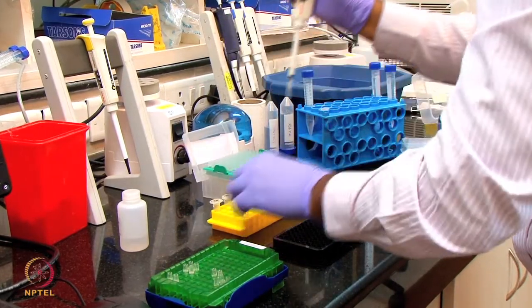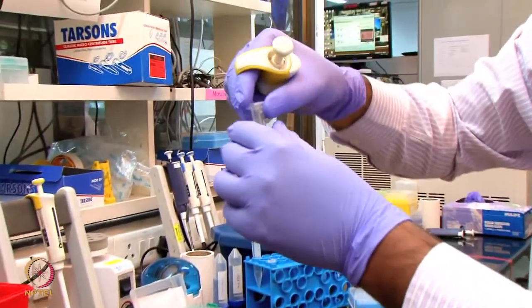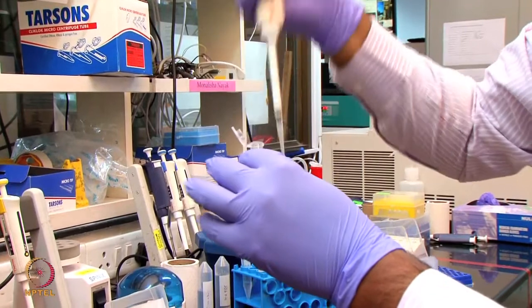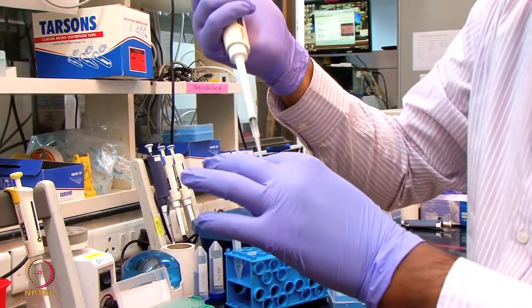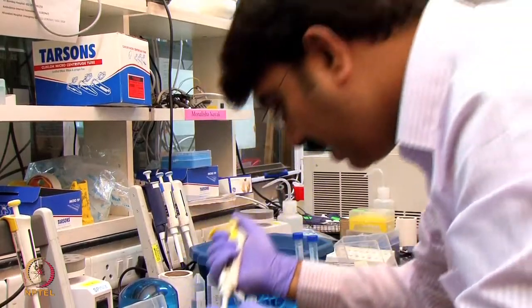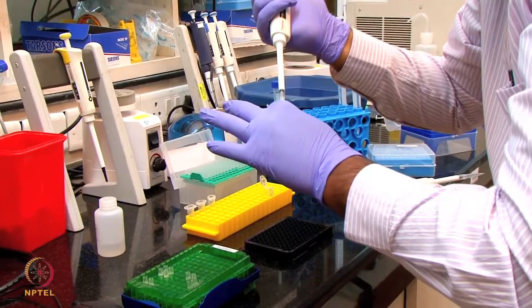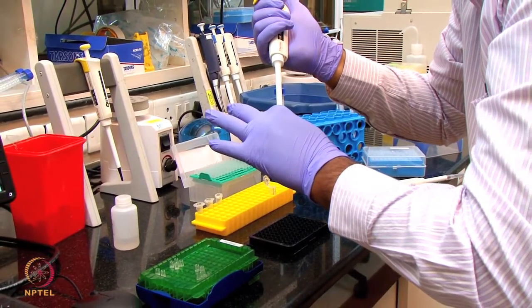Now I am putting the biotinylated anti-apolipoprotein. So now I am going to add 200 microliter of each biotinylated anti-apolipoprotein to the 96 well plate.